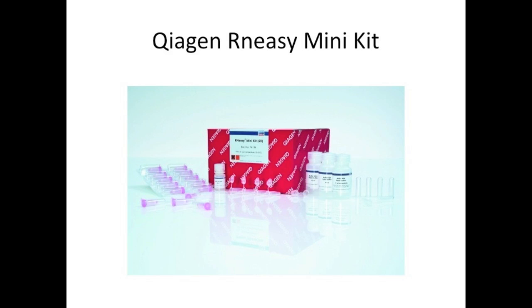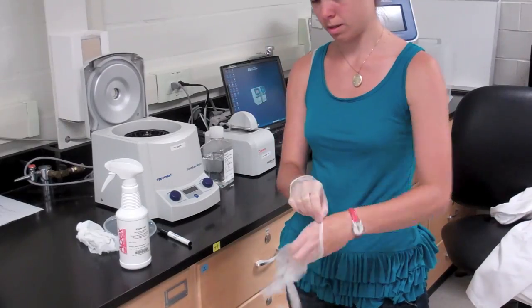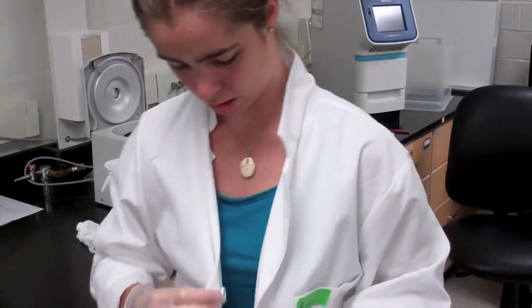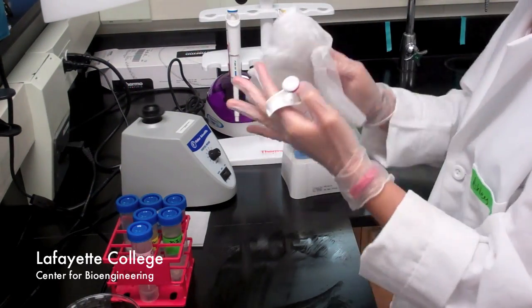In this video, you will learn how to purify and obtain RNA according to the Qiagen RNeasy technique. Before beginning, make sure that long hair is secured in a braid or a bun, and put on gloves and a lab coat that has clean sleeves. Spray all surfaces and equipment, including your hands, with RNase DNase-free cleaner.